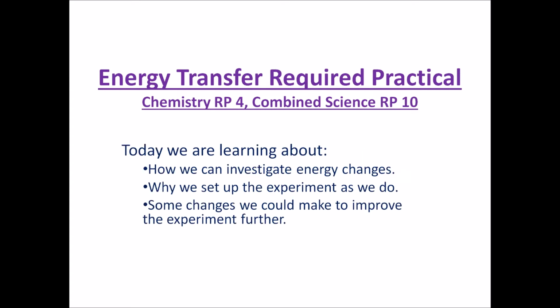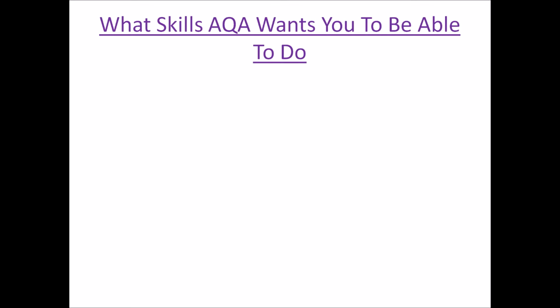What we're going to be looking at is how we can investigate energy changes in a chemical reaction when we do a practical, why we set up the experiment as we do, and some changes we could make to improve the experiment further. Now, AQA wants you to be able to perform the following skills.